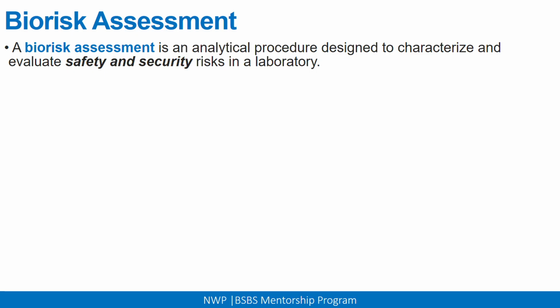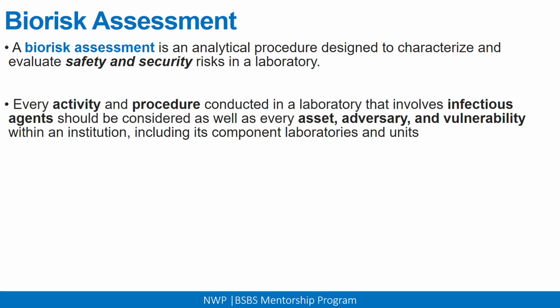You can't just end up with the risk without actually analyzing some form of information and trying to determine certain factors that are analytical in nature about the risk. So it is always an analytical procedure. Of course, every activity and procedure conducted in a laboratory that involves infectious agents should be considered, as well as every asset, every adversary, and vulnerability within an institution, including its component laboratories and units.